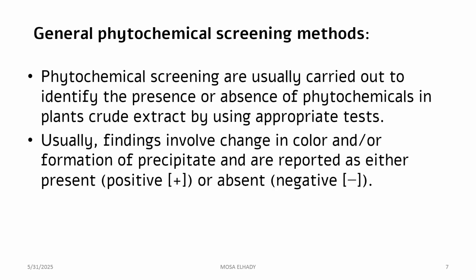There are several methods used for screening of plant extracts to detect the presence or absence of phytochemicals, and the main common feature of all the methods used for phytochemical screening is that they should be cost effective. They are feasible and of suitable cost to be carried out, because they are mainly used to detect if the secondary metabolite is present or not.